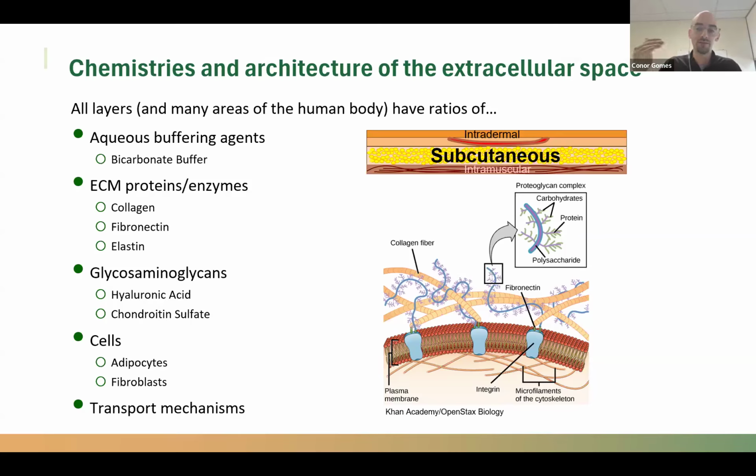The only thing left to validate is running an assay where we're able to conserve the material in there for 6 days, which is a more complicated factor, and then doing the same exact activity assay thereafter. If it is a question of interest, Pion does have the ability to really see how long these enzymes will stay active, and if we have the ability to refresh that activity.